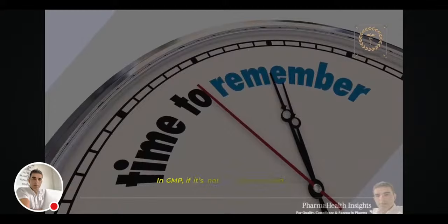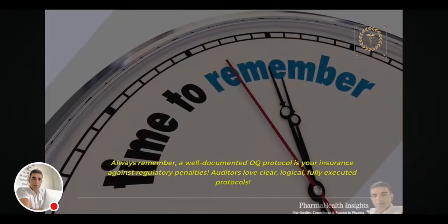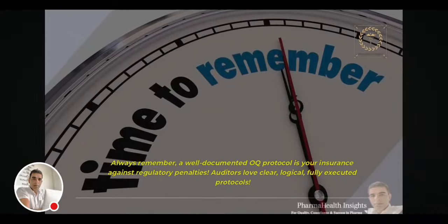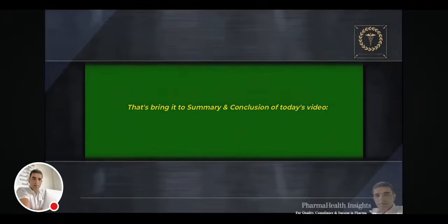Remember, in GMP, if it's not documented, it's not done. Always remember, a well-documented OQ protocol is your insurance against regulatory penalties. Auditors love clear, logical, fully executed protocols. That brings us to the summary and conclusion of today's video.